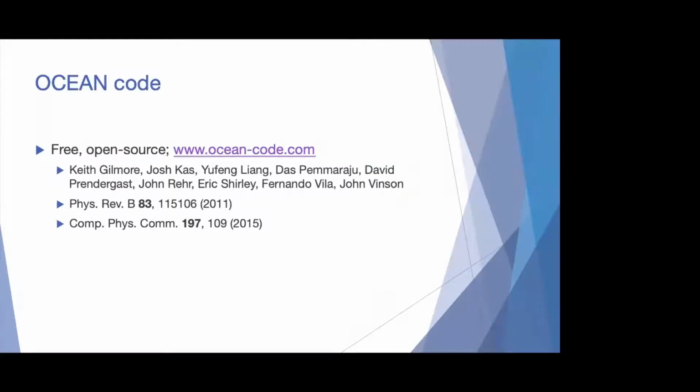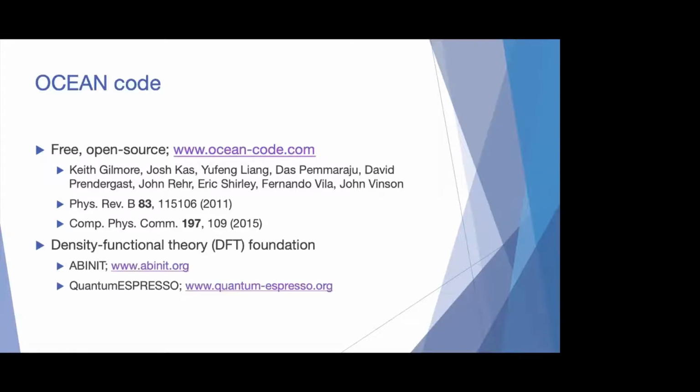All of this is packaged together in the OCEAN code, which is a nice free open source code. You go to this site to learn more. And it's the result of a number of people working over the years, with a couple different publications out.